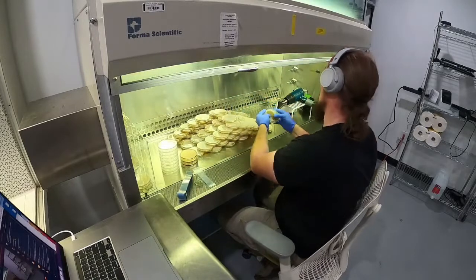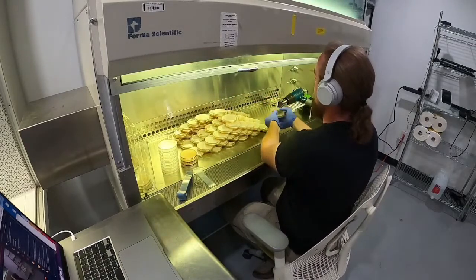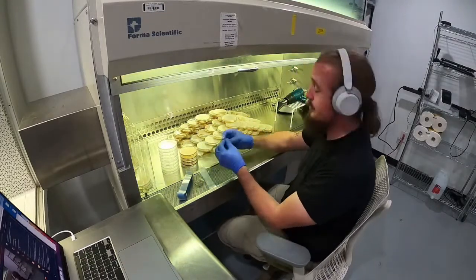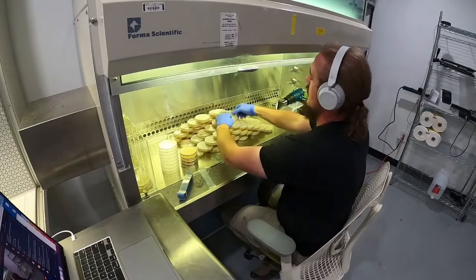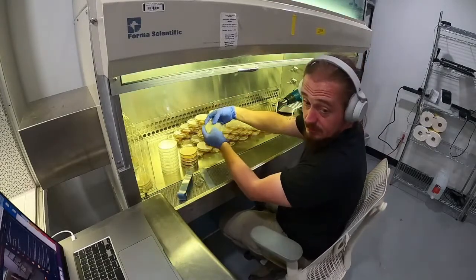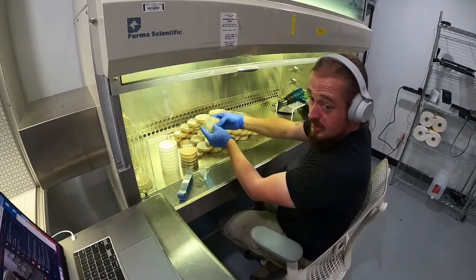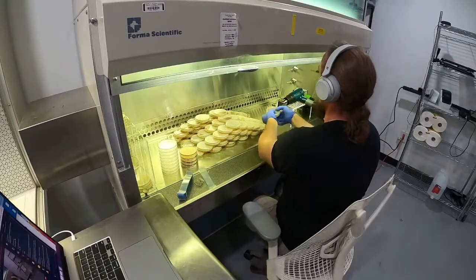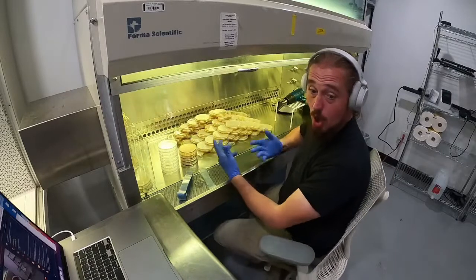So we actually use both here. If we're starting off a new species, very frequently we won't have liquid culture for it. And so what we'll do is start with a couple of agar plates put to millet. We'll grow that out and that will be our grain master. And then we'll expand that grain master via grain-to-grain to 10 more bags, right? So that's how we treat agar to grain.